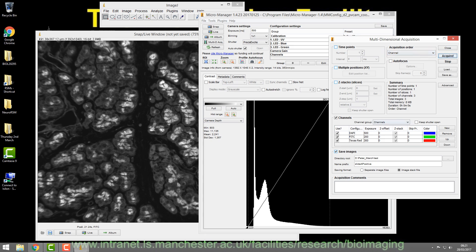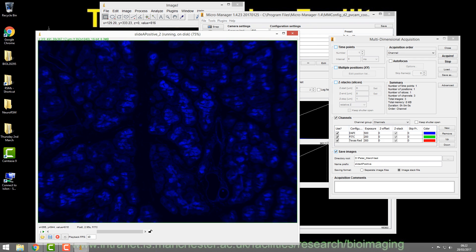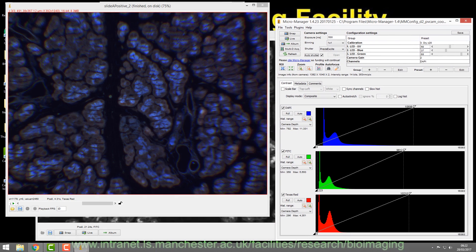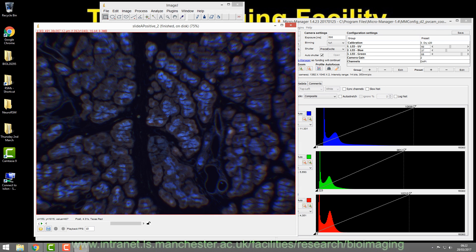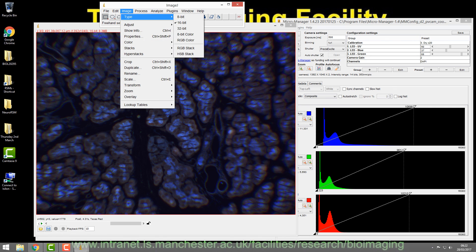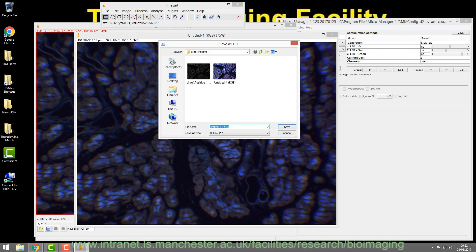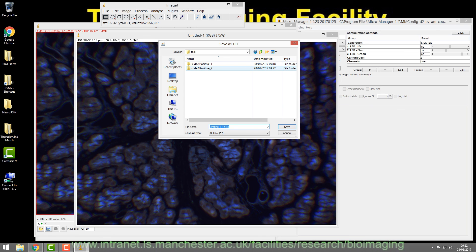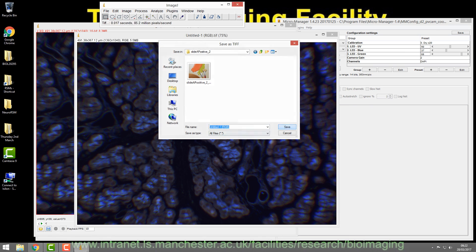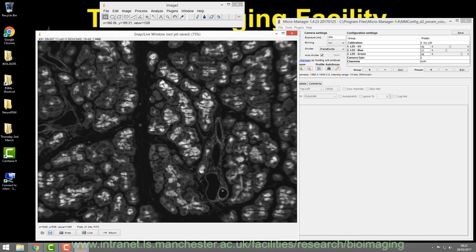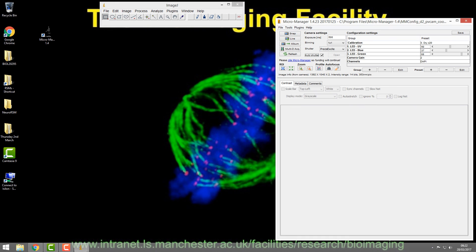Go to Multi-Dimensional Acquisition — all the settings are the same as before. Stop live, close the shutter, hand control to the PC, and press Acquire. It takes the three images using the same scaling applied for the first image. Save it as RGB Color and save it as a TIFF — it auto-increments to image two. That's all you have to do. Hopefully that makes sense — thank you very much.